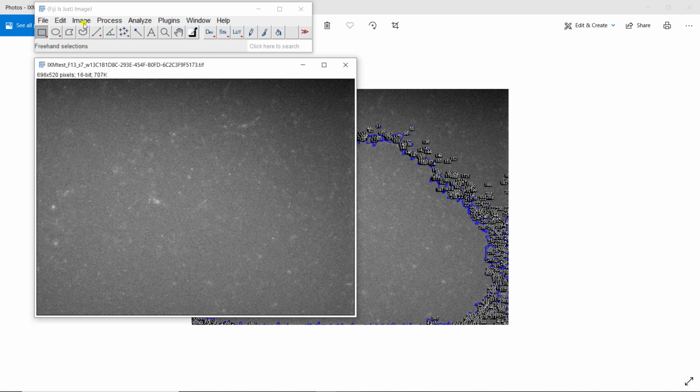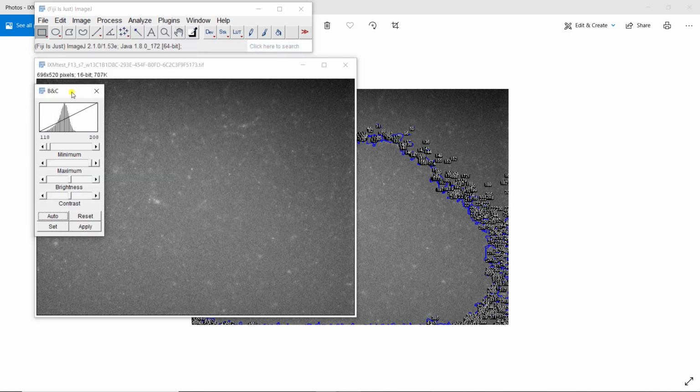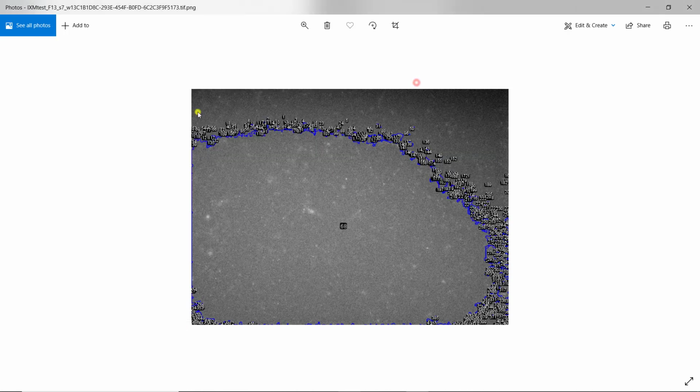You see, it seems here that there's nothing. Yeah, you see you have values between 118 and 208. So it means that it's just background. So there's no nuclei. However, our pipeline tried to identify something, so it identified this small object. So here clearly, either you try a different way to do it, or you just disregard it because there are no nuclei in this image. And that's it.